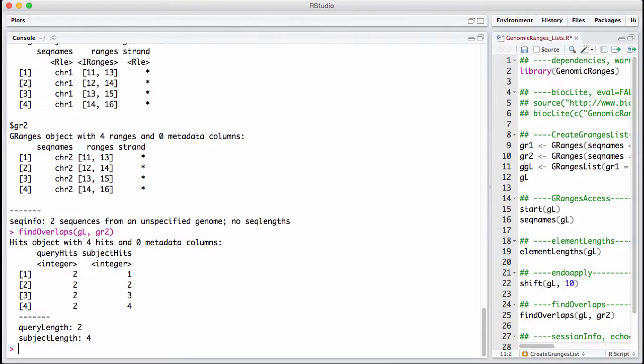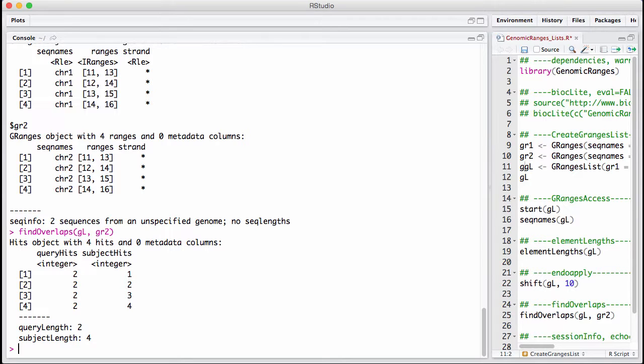So findOverlaps thinks of the gRangers list as having two elements. We have an overlap between the first element if any of the ranges inside that element overlaps. So now I'm really doing overlap between a whole gRangers and a single range. And I'm going to count it as an overlap if any of my ranges in my gRangers overlap a range in gr2.